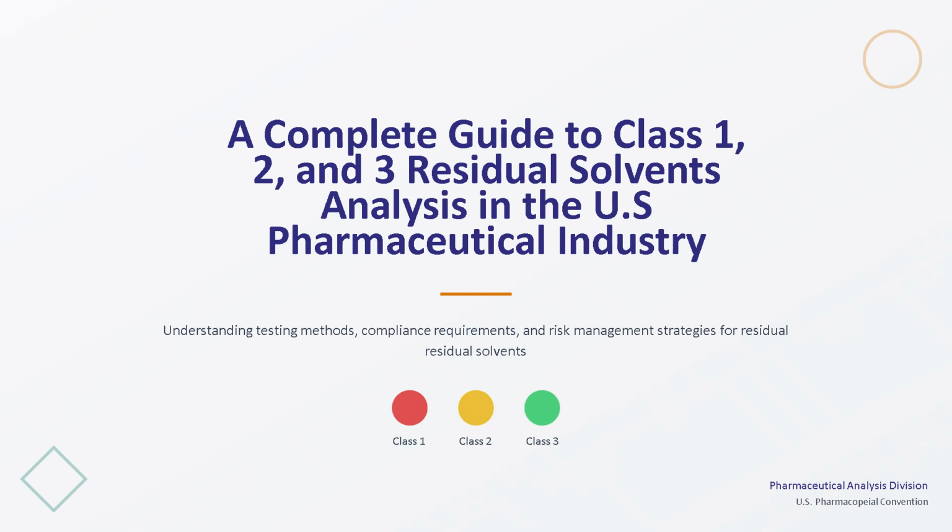These solvents are leftovers from manufacturing steps like synthesis, crystallization, purification, or drying. And even though they're invisible to the naked eye, they can impact patient safety if not properly monitored. Let's dive into the framework, the testing processes, and the strategies that keep our medicines safe.